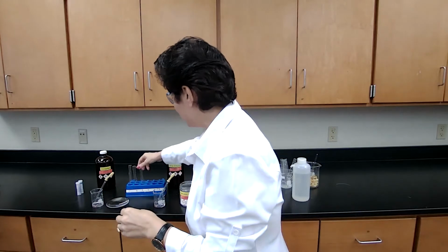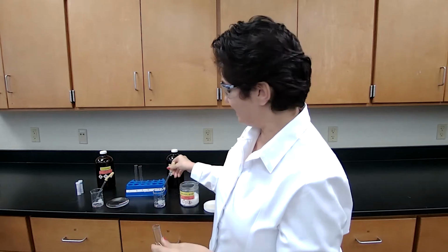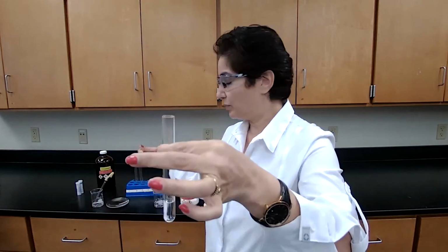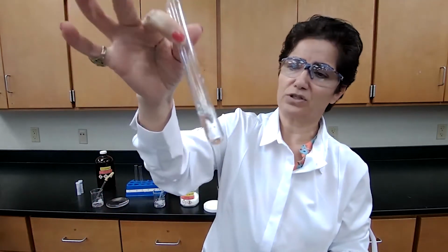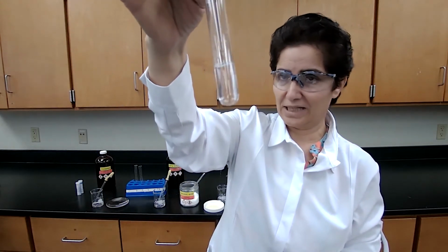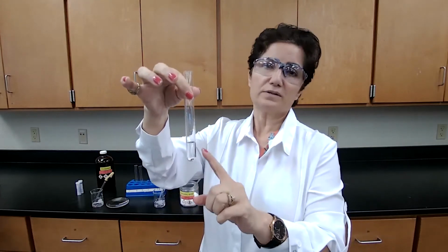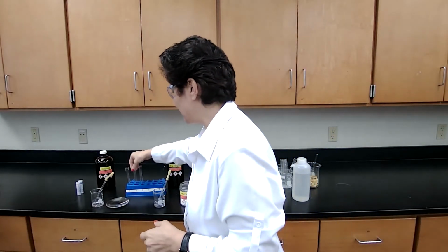First compound I'm adding to the HCl is ethanol. Again, it kind of defeats the purpose, because ethanol is soluble in water, and HCl also is an aqueous solution. So it would dissolve, and it did dissolve. I just added like 5-6 drops. It shows only 1 layer. So it is soluble in HCl solution. This is not for all alcohols, but if the alcohol dissolves in water, it will dissolve in HCl and also in NaOH, as you saw earlier.